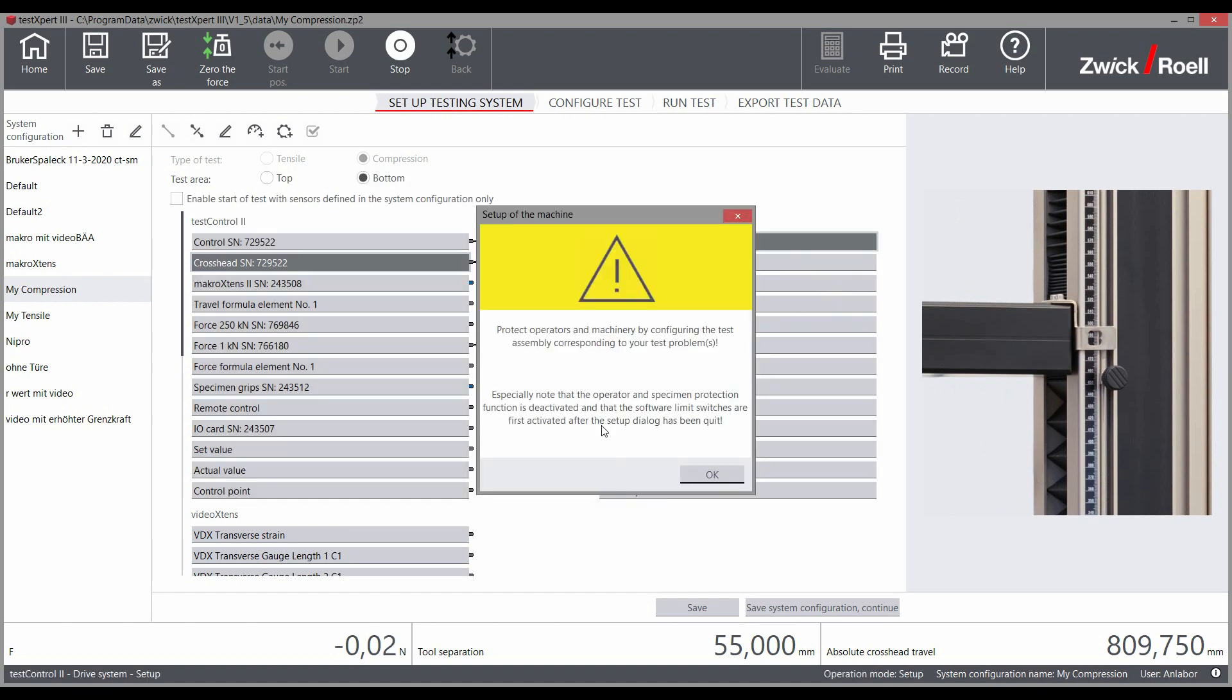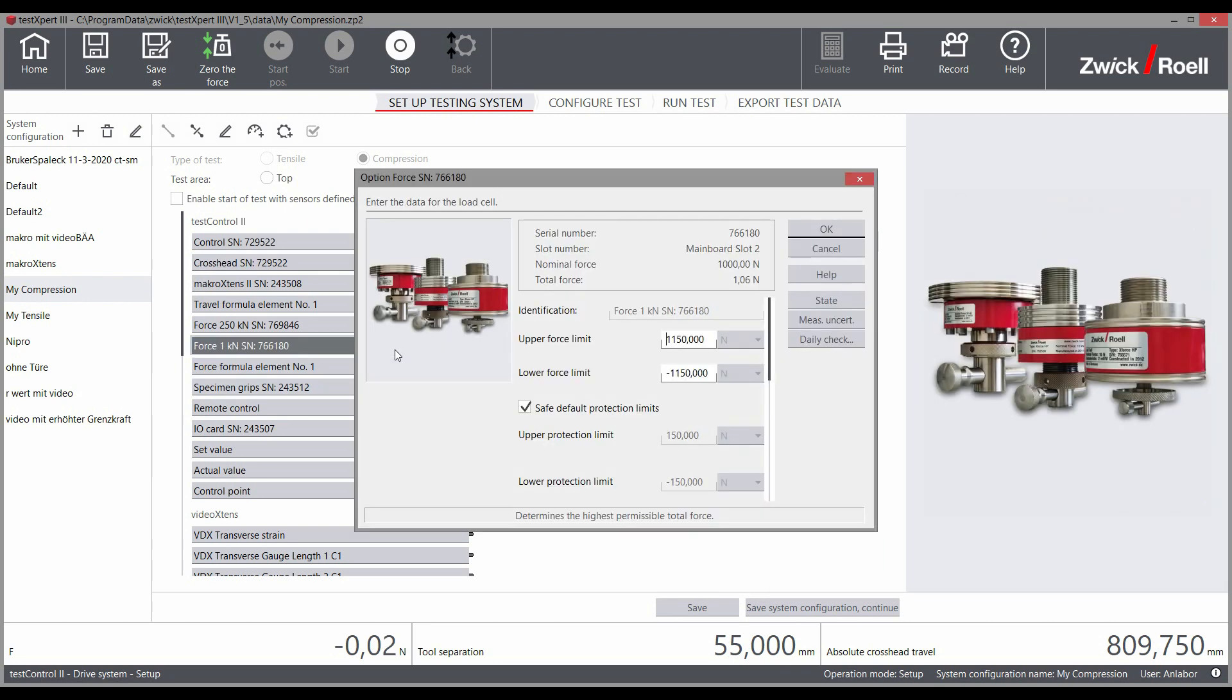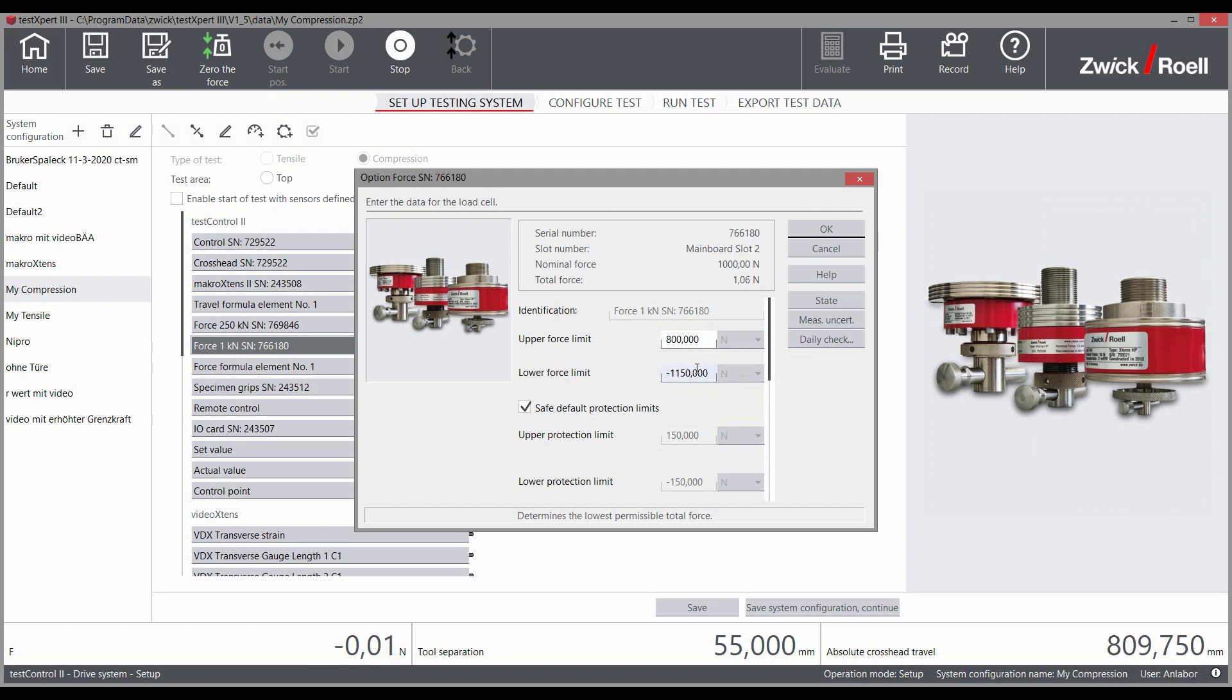The person responsible for the lab approved the setting via key switch and you can now adjust the load cell settings. In this case, restrict the force limit to 800N, provided that you do not want to load your test arrangement with a force that is any higher.